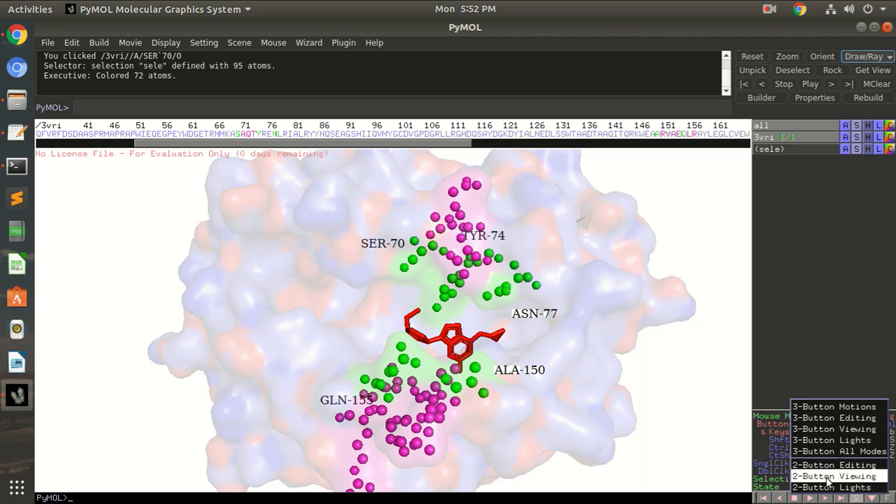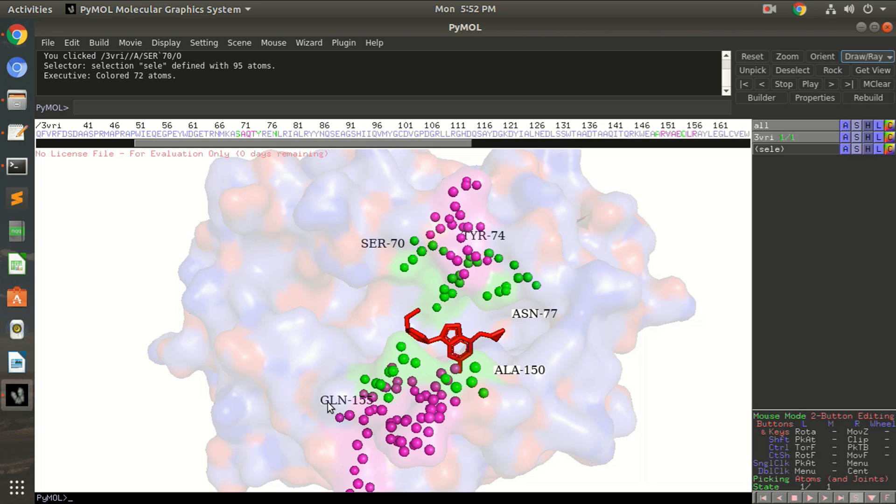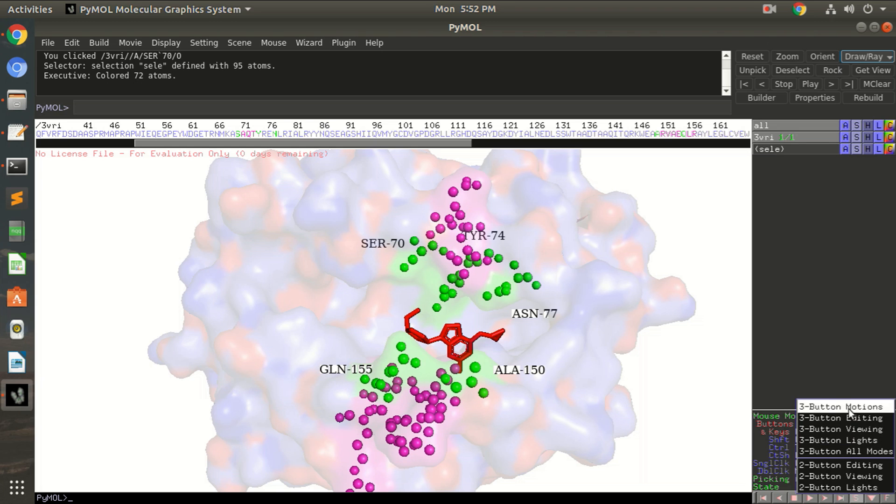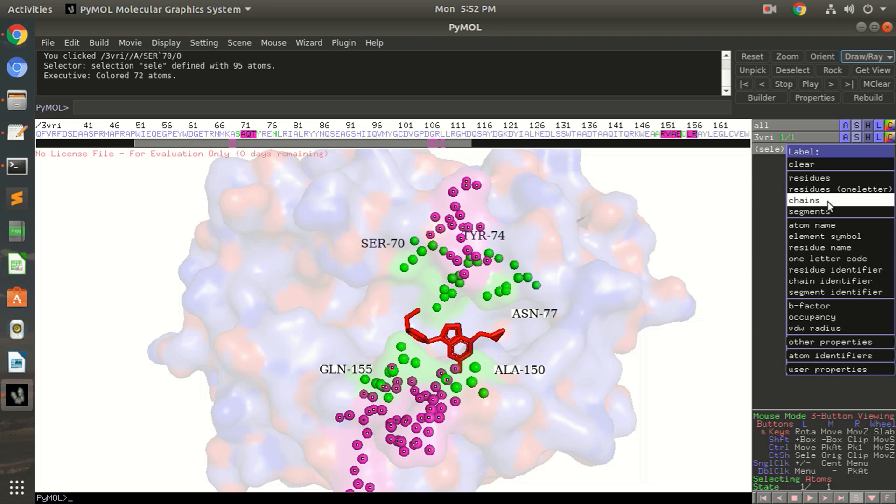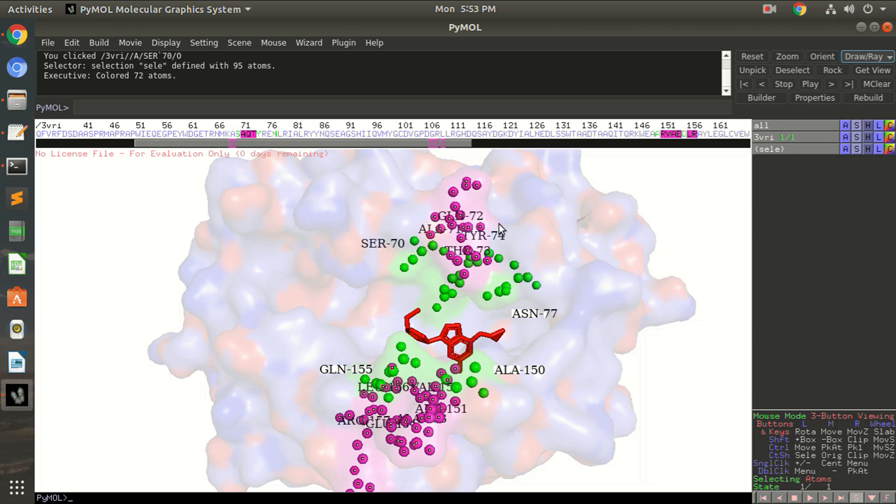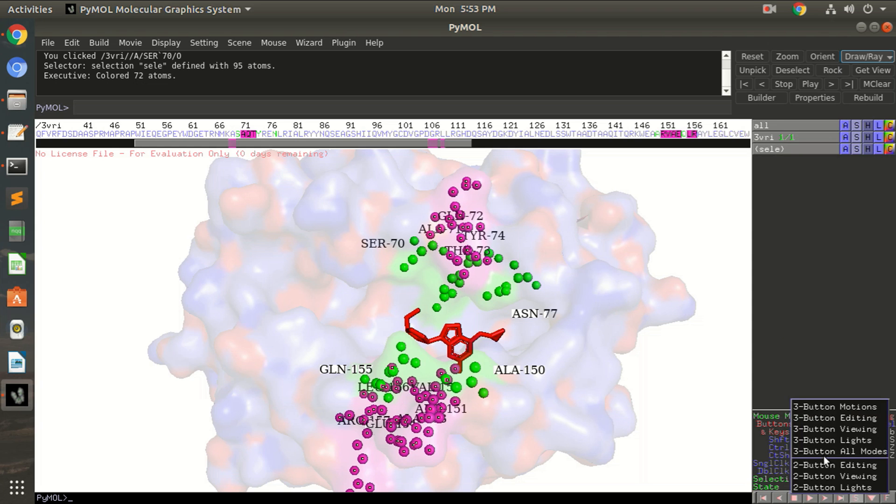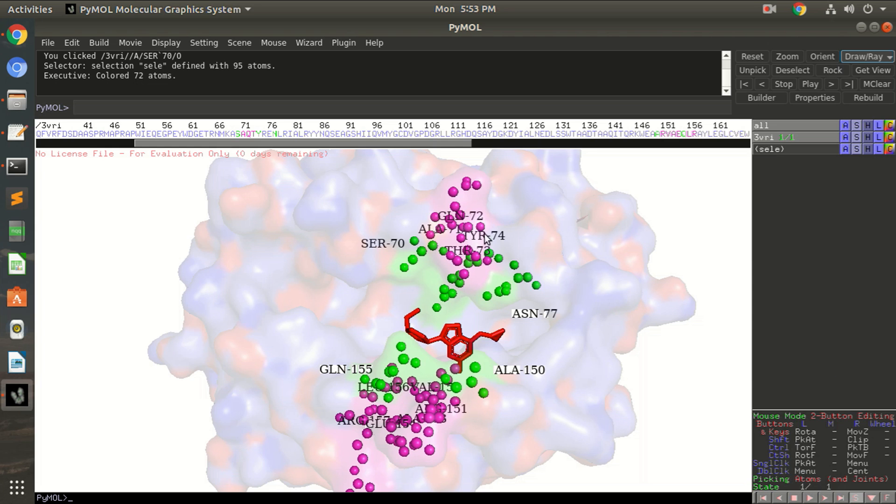So if you can go to the editing mode, control button and then this. Okay, go back to three button viewing mode and you can always label these residues, label residues. And then again since these are not visible enough so you can move them, move the labels as I have told you earlier.